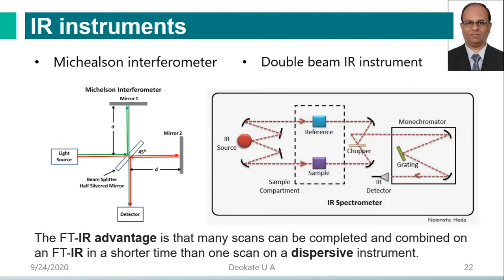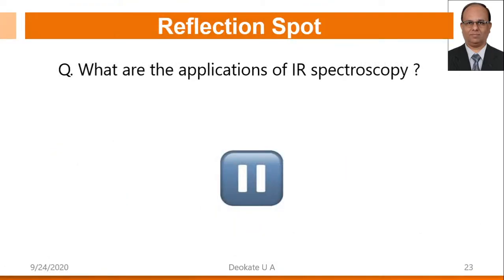When the waves pass, they are displaced at two angles. The mirror moves a small distance continuously, so that the wave produced will propagate at a different angle, and that wave is bombarded on the sample. So more intense radiation is bombarded on the sample. The intensity of radiation reaching the sample is more, so they are more sensitive, giving good results. Therefore, all modern instruments use FTIR.